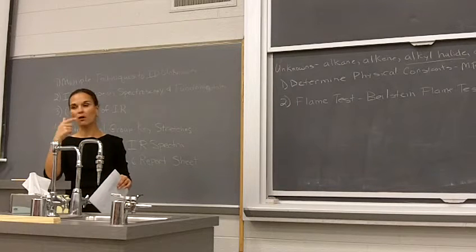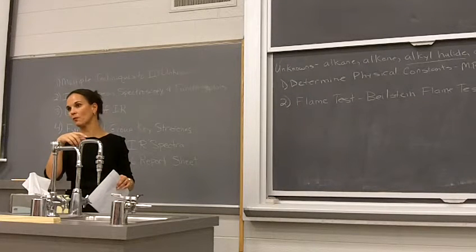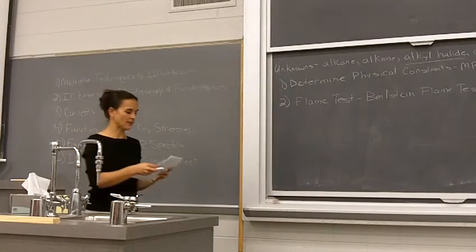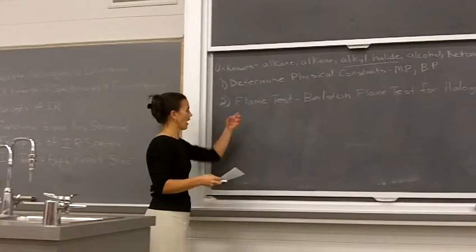And we'll demo what that's going to look like with a known halogenated compound in lab this week, okay? But that's how you would check for your alkyl halides.